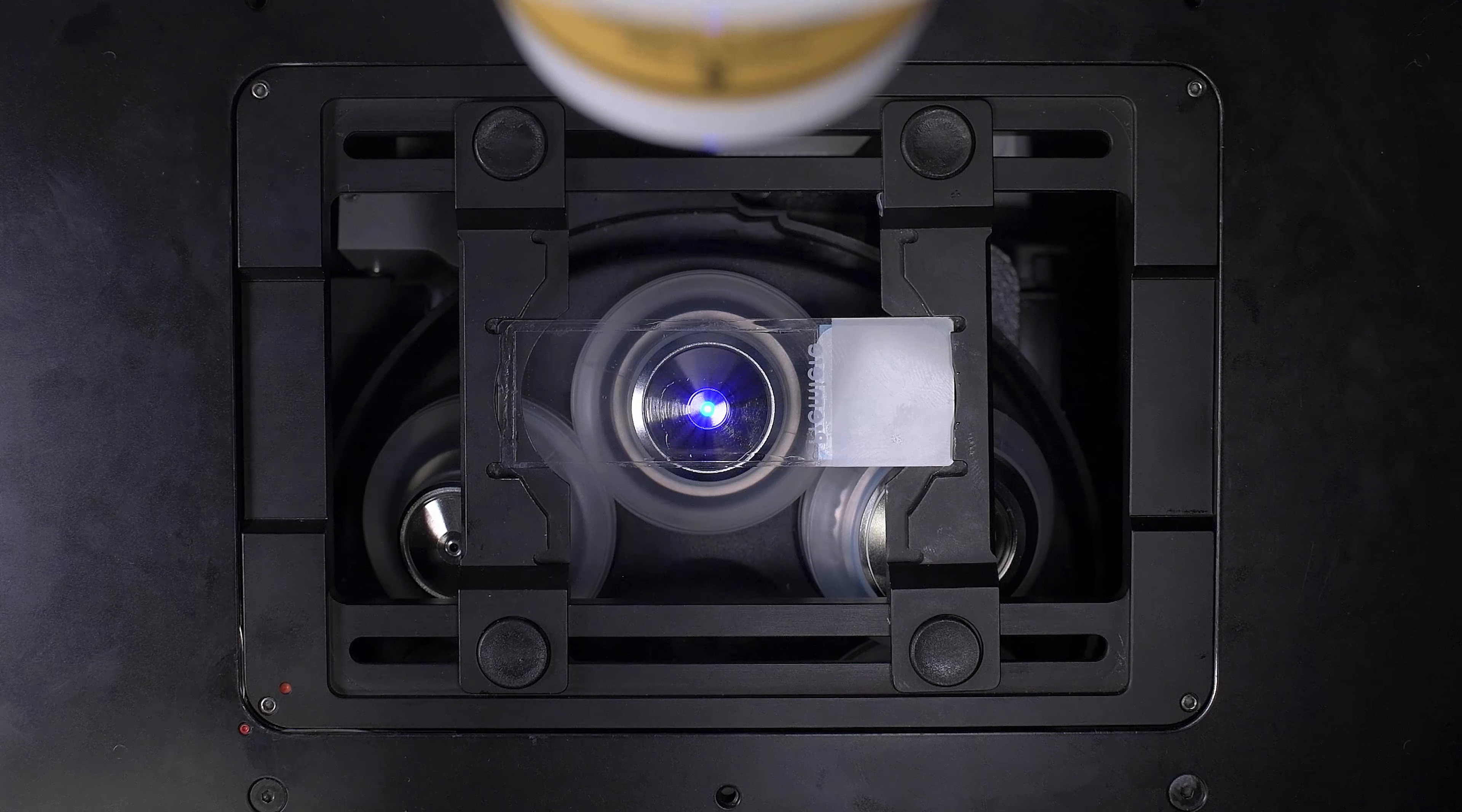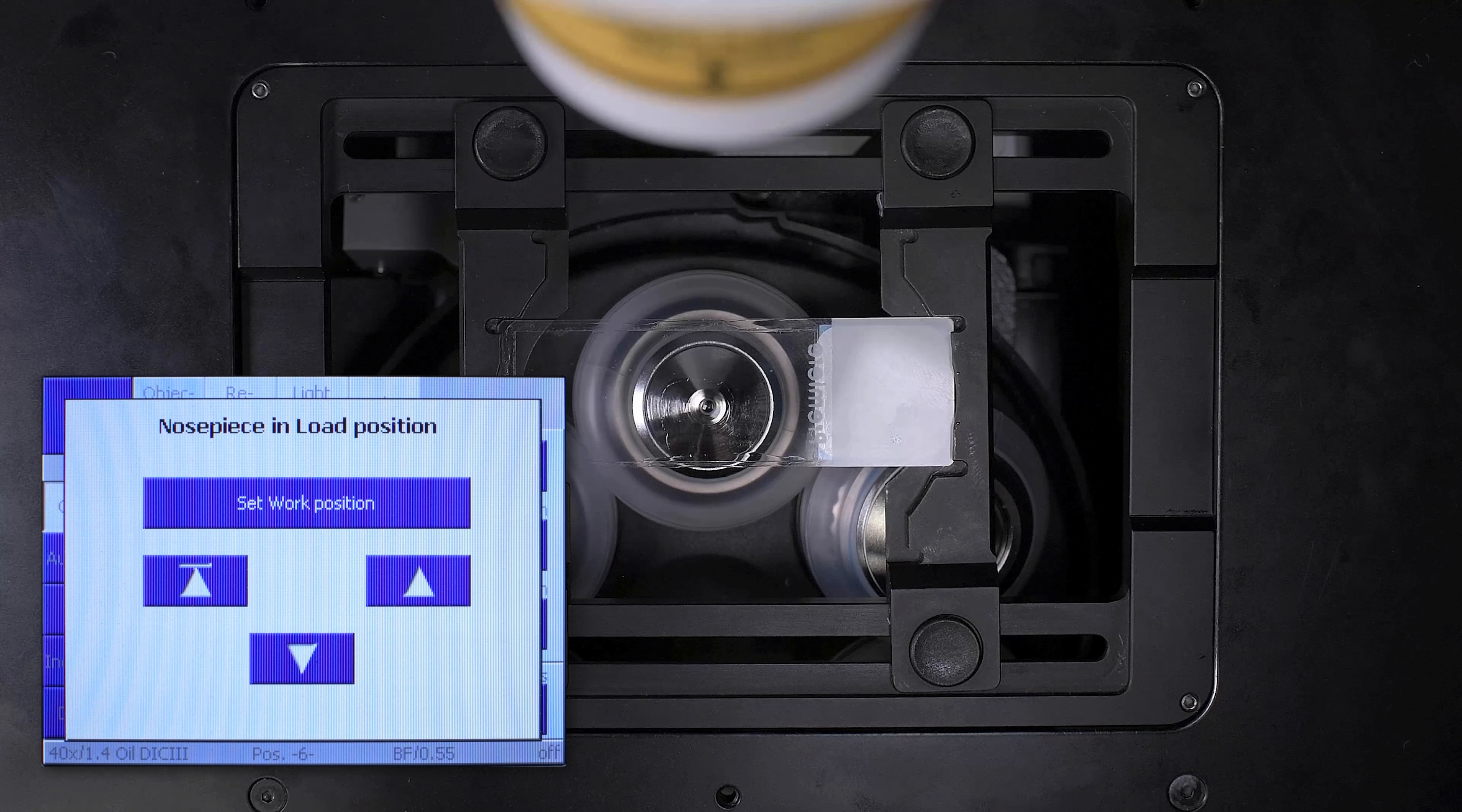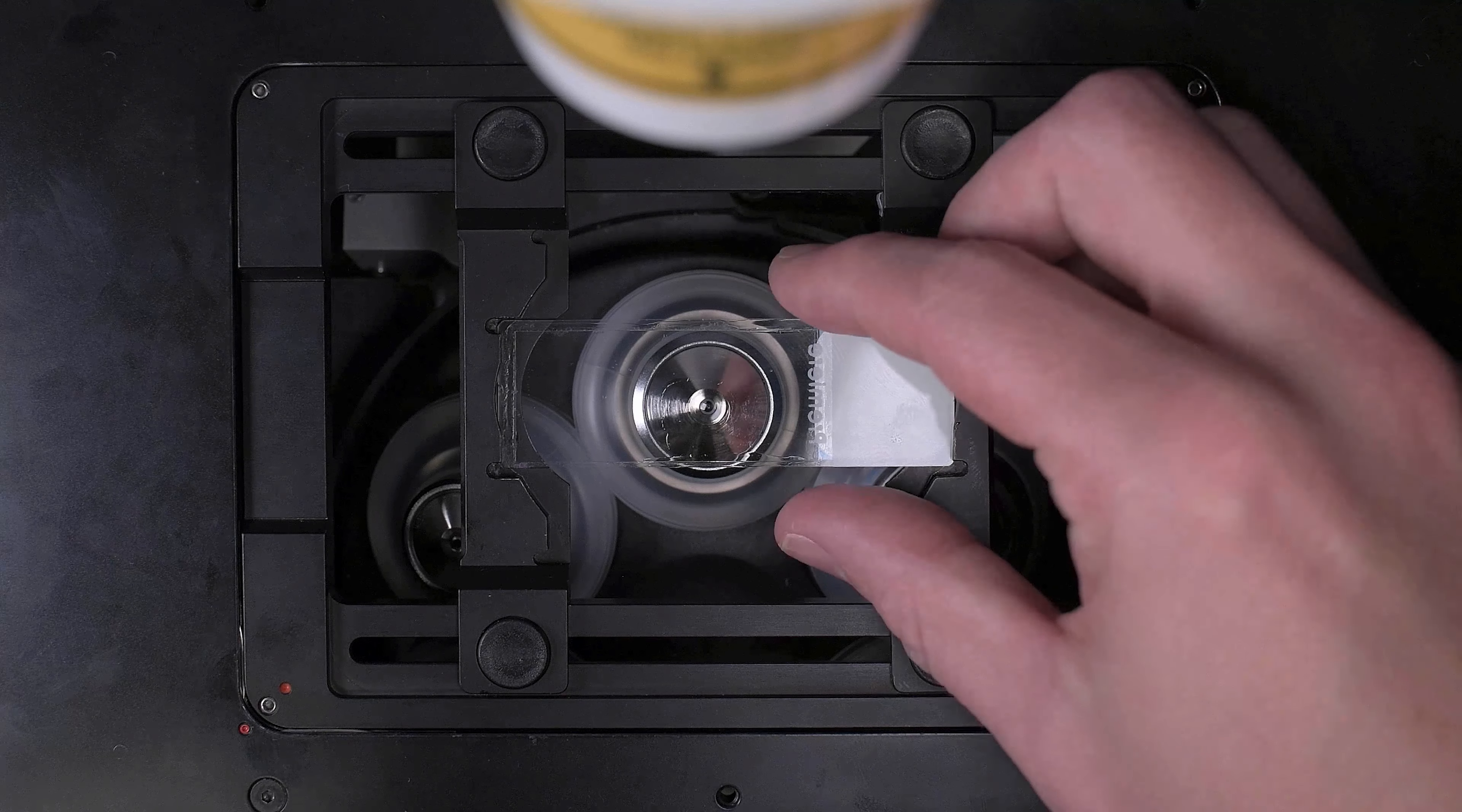When you are ready to change slides, we first want to move our objective to a safe position. From the right-hand side of the TFT display, click Load Position to move the objective to the lower limit of the focus drive. Then click Set Work Position. Remove your slide and replace it with the next slide you want to image.